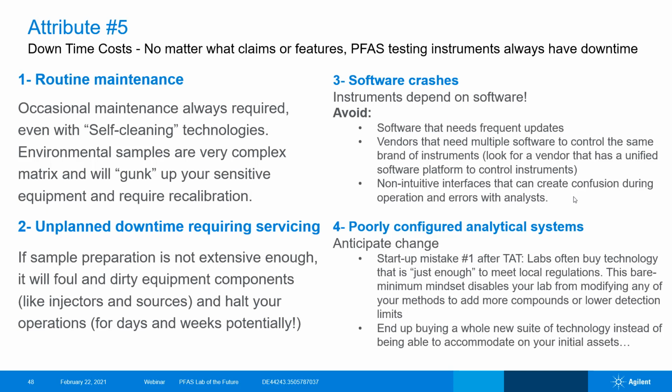One of the biggest things that is not thought of by labs is that they often do not think about technologies to future-proof the lab, right? It's always looking at things that can just about meet regulations at this time. That can become a real problem though, because as PFAS regulations drop, you don't want to be in a place where you haven't future-proofed your lab and then are required to invest in newer capital again as well. So something to think about there too.